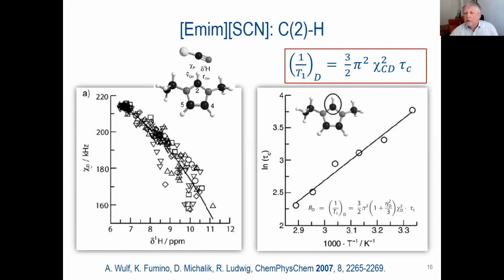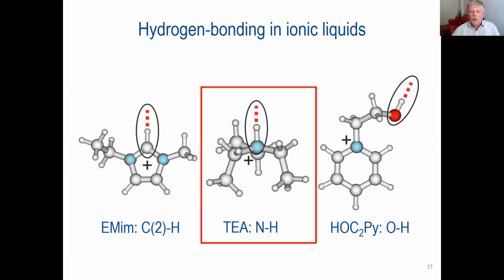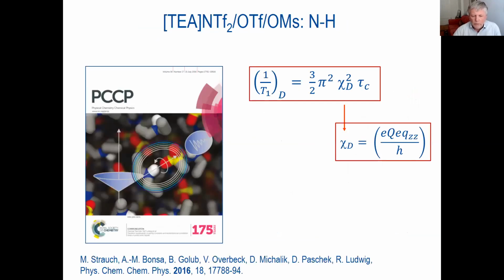But in particular, if you are limited to the extreme narrowing region, you can get reliable coupling parameters and finally also reliable correlation times. So that was some older work. So these triethylammonium or trialkylammonium based systems, they are similar. So there we have the same situation.